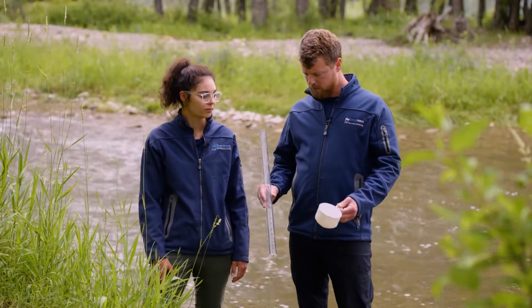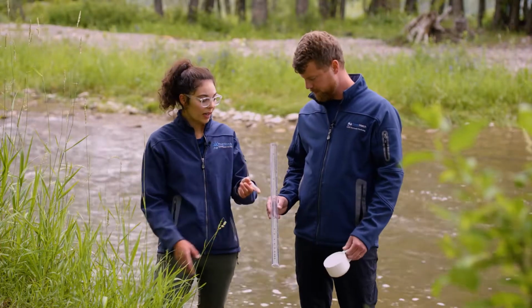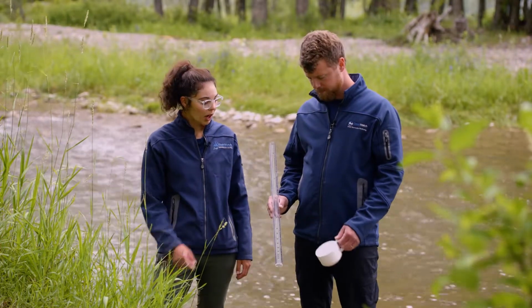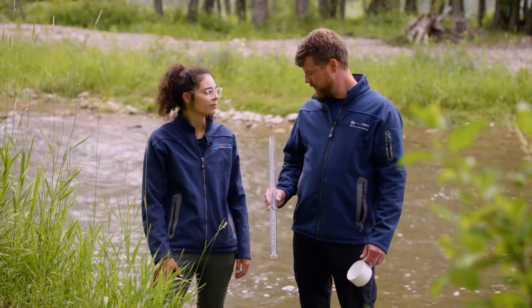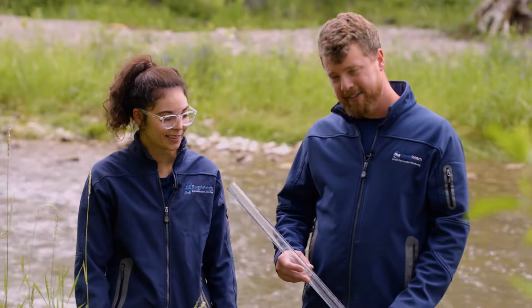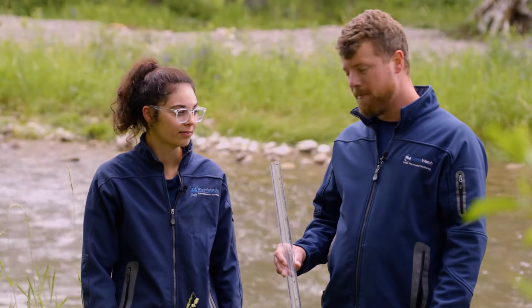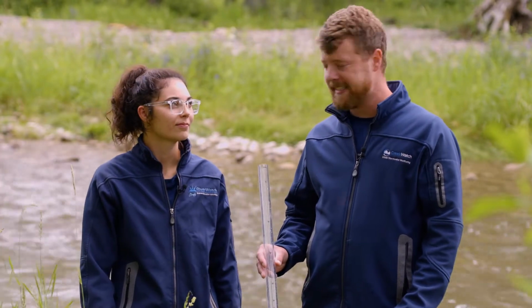Now we're looking at here, what are we using here to collect this sample? We're using a turbidity tube and a little plastic cup. Our turbidity tube has markings along the side for NTUs. What are NTUs? I don't know, Reed. Why don't you tell me? So NTUs stand for Nephelometric Turbidity units. In terms of how they come up with that word, I am not exactly sure.